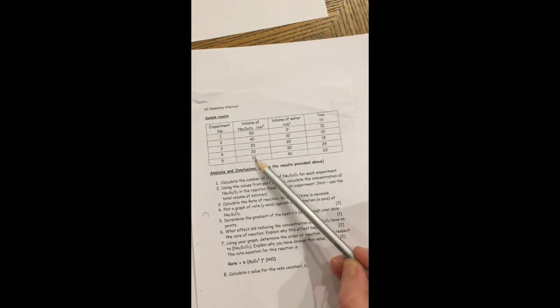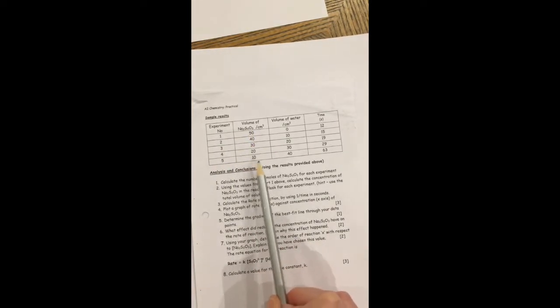And the effect of that then, we measured how long it took for the cross to disappear. So you can see it's taking a longer time the less concentrated the thiosulfate is. So as the concentration of thiosulfate decreased, the time it took for the sulfur to be produced and therefore to make the cross disappear increased. So the rate got slower.